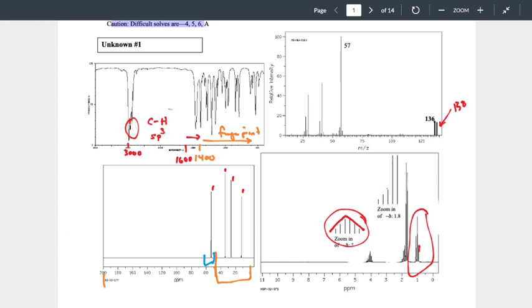We look kind of carefully, and it's always imperfect, but we're seeing this middle set. 2 shorter, 1 in the middle. That's one set. When we move to the next set in the middle, that one's really hard to kind of piece together unless we look at the zoom in, and the zoom in makes it a little bit easier.